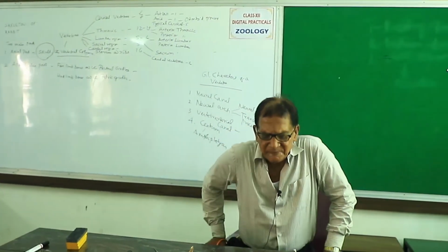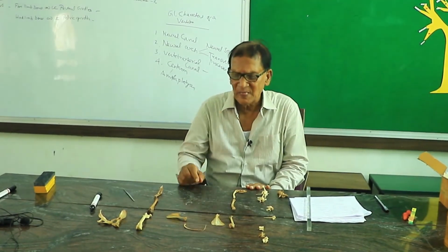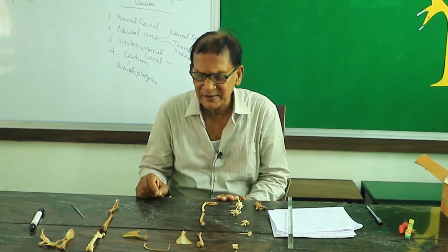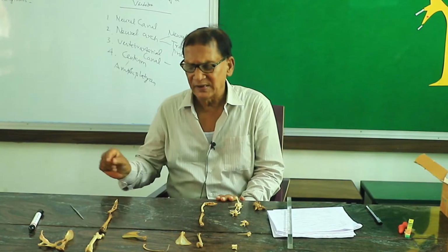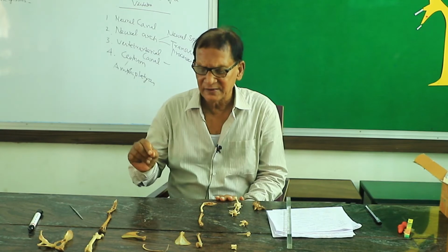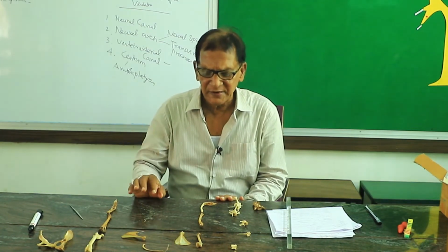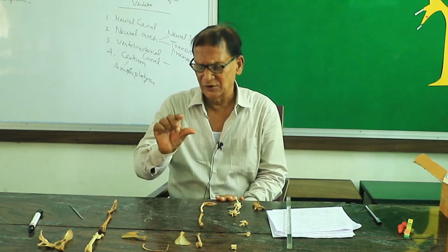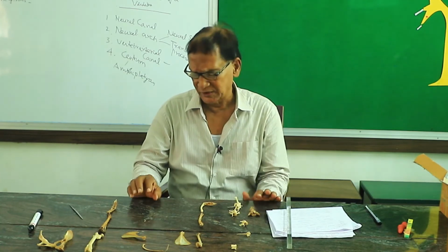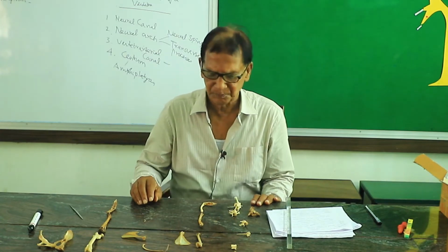The anterior ones have, as usual, the centrum and the neural arch, maybe the neural spine, but the posterior ones lack all these characters. They are only seen by their centra. So caudal vertebrae, 16 in number, form the long tail of the rabbit.